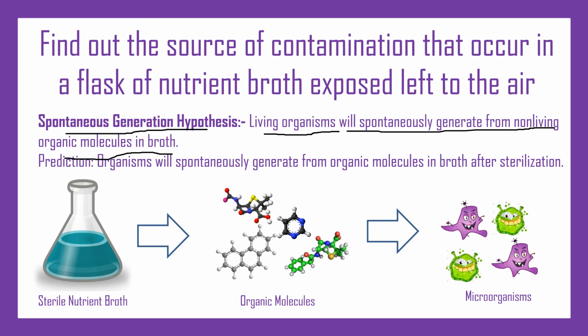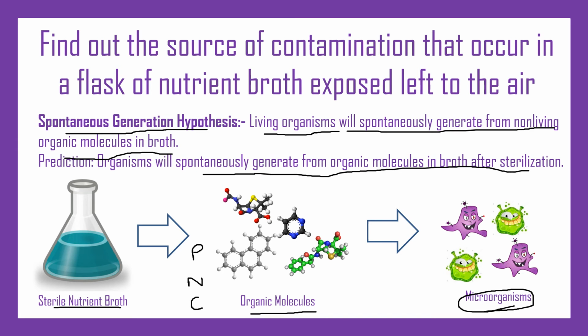So I told you that the nutrient broth contains organic molecules like nitrogen, carbon, phosphorus, and many other nutrients, and those organic molecules will help in the generation of microorganisms. So from this we could predict that organisms will spontaneously generate from organic molecules in broth after sterilization.